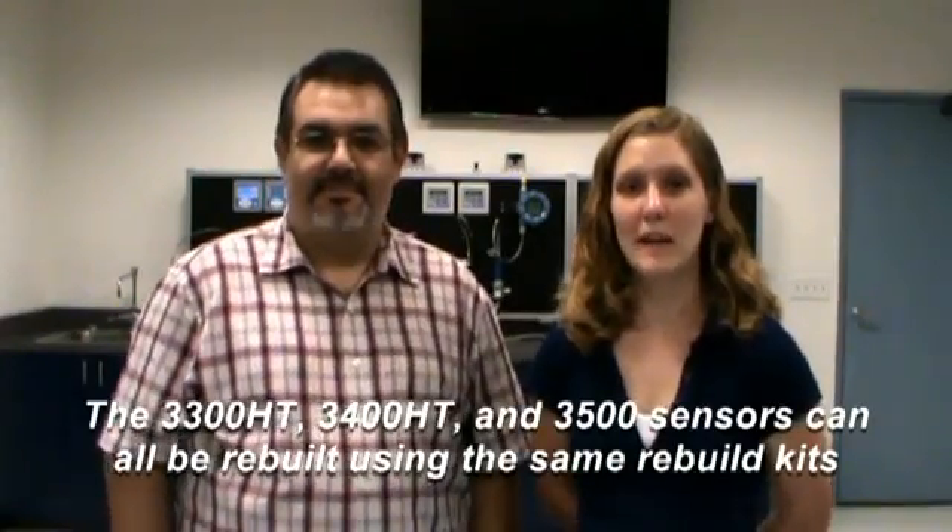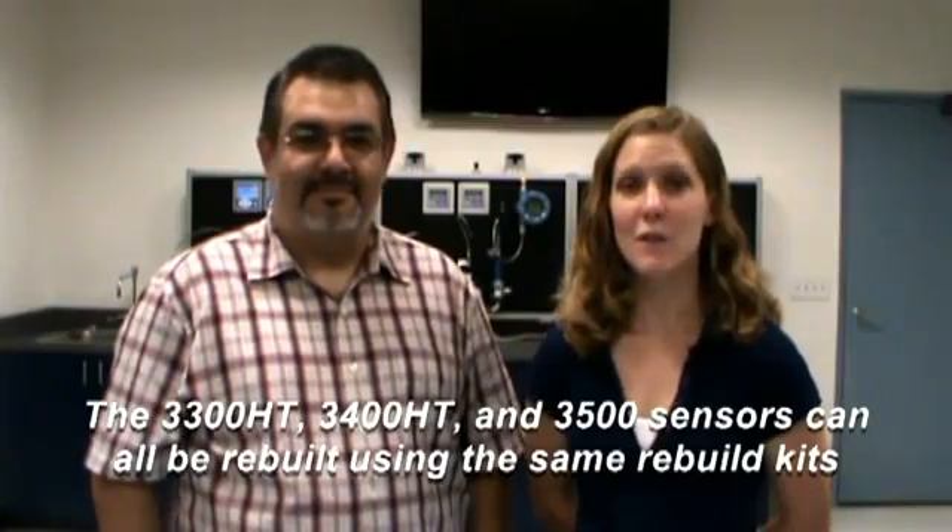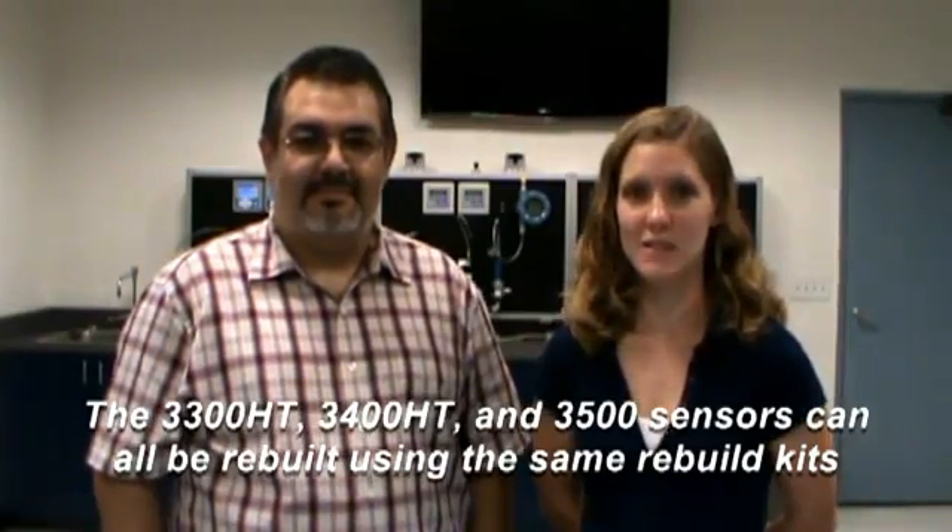Today we're going to show you how to rebuild the model 3500 PerfX sensor. This video also applies to rebuilding the 3300HT insertion and 3400HT retractable sensors.